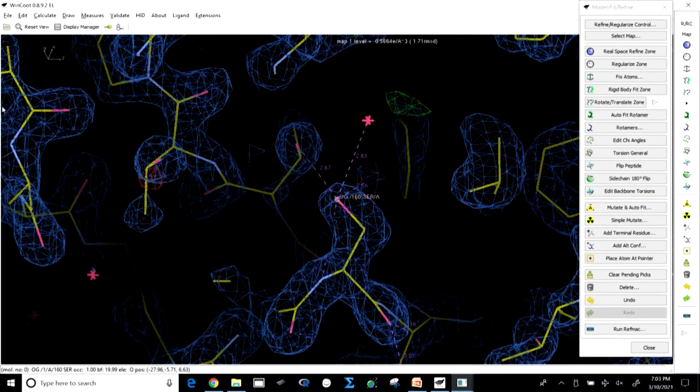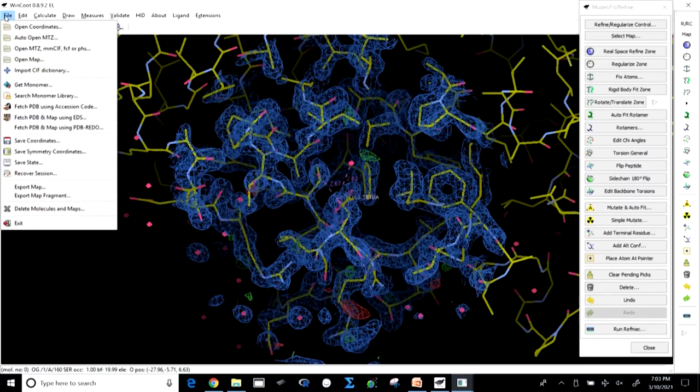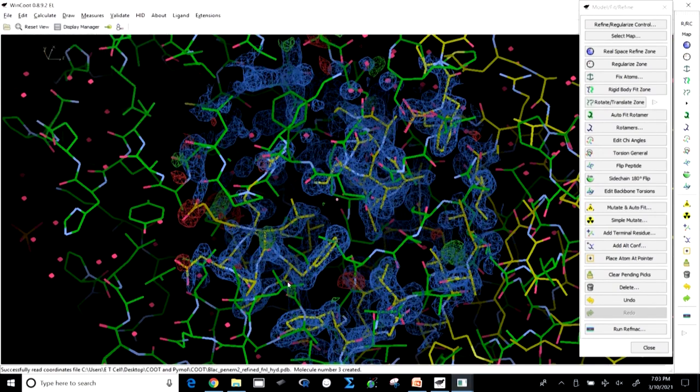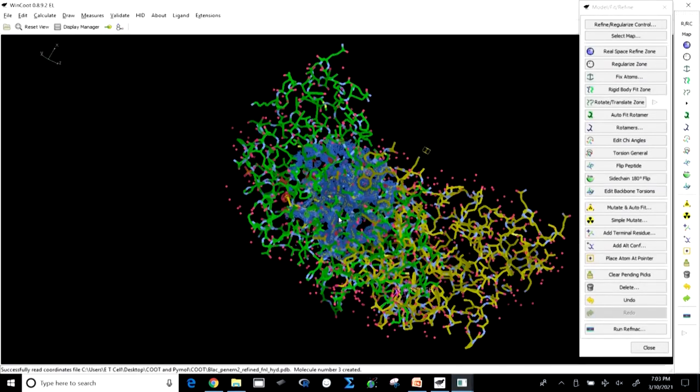So, what next? Let us go to one other structure. Load the coordinates of the PNM structure. The PNM structure is there. Now, if you remember, all the 4 structures come from the same protein, so they have the same amino acids. So, you could compare them.